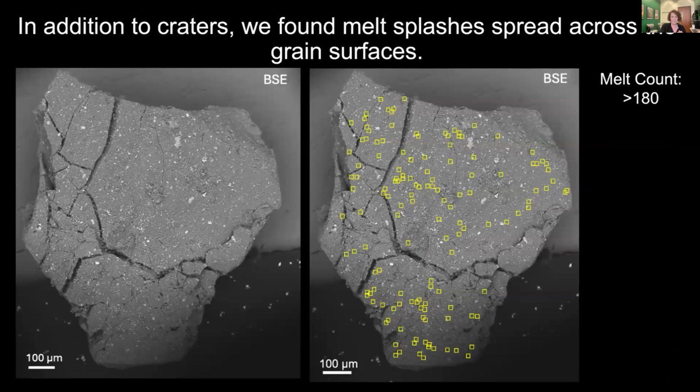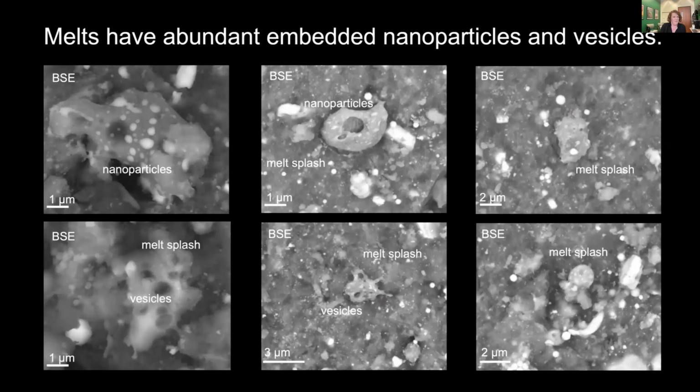If you think about impacting the surface, it's melting material in the crater, but it's also ejecting melt material that can then be distributed across the surface of the grain as well. So in addition to the craters, we see melt droplets or glassy splashes all across the surface of these particles, some of them more than 180 melt deposits spread across the surface. And looking in the scanning electron microscope, the morphology and composition of these melts is really interesting.